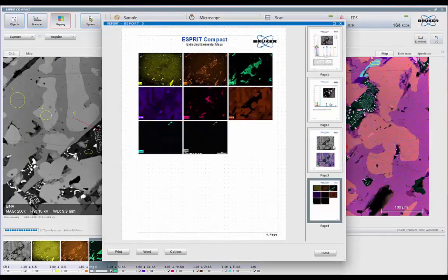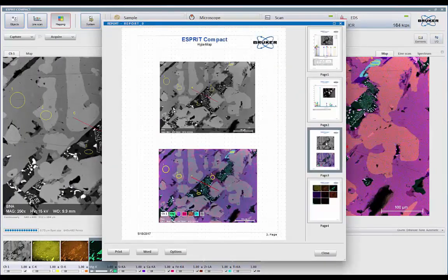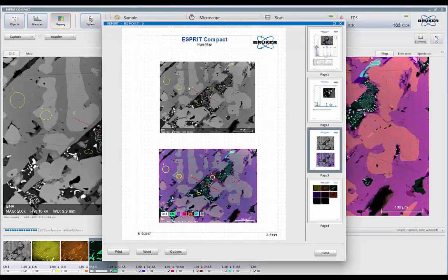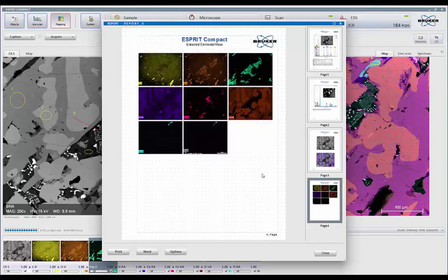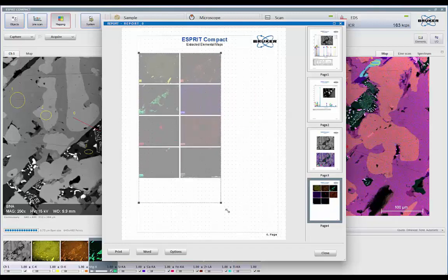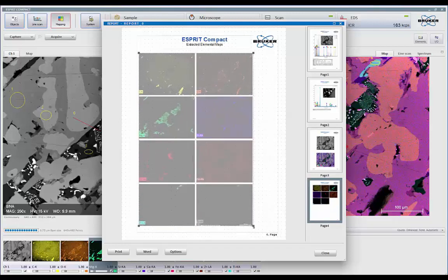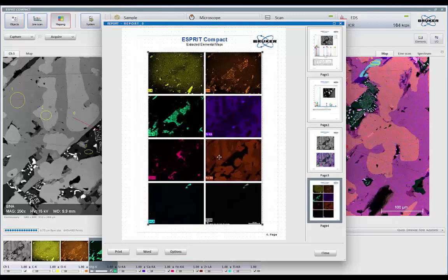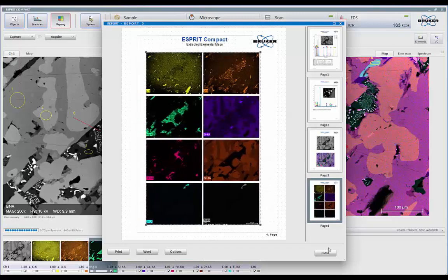So now I have, on the first page here, I've got my original image showing all my annotations. I've got my composite map down here. And then my individual maps here. And again, I can rescale this. So if I want them side by side, I can do that pretty quickly. And there are my maps.